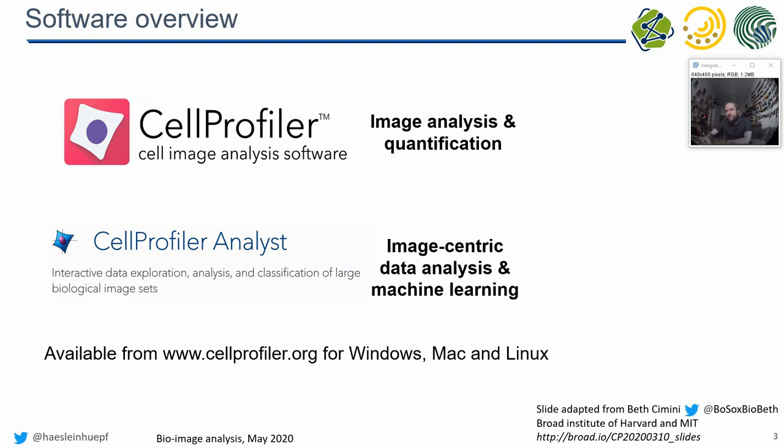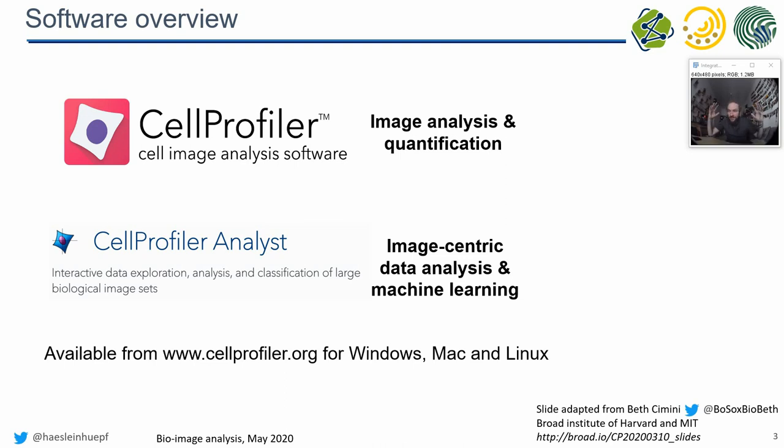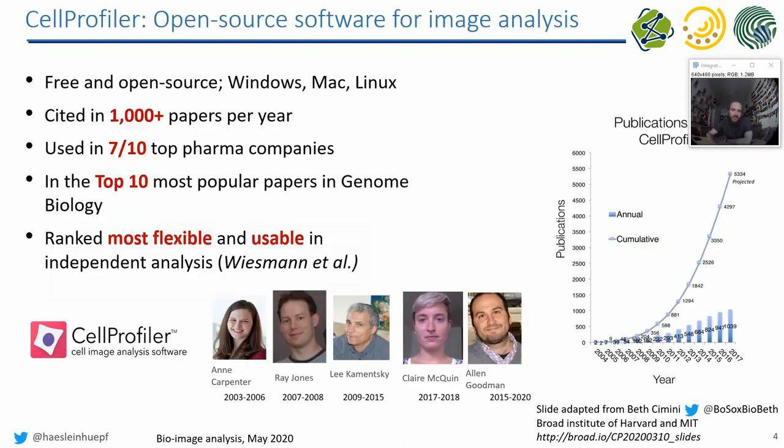There are different softwares in the CellProfiler universe. CellProfiler and CellProfiler Analyst, while the Analyst is more like the advanced version where you can do a lot more with images and machine learning and data analysis. We will today just look in CellProfiler and I would like to just show you how an image analysis workflow in CellProfiler looks like.